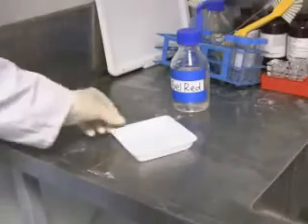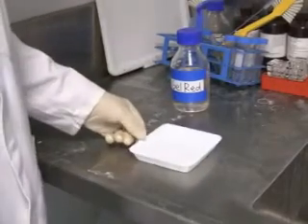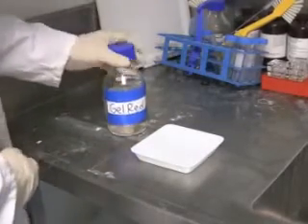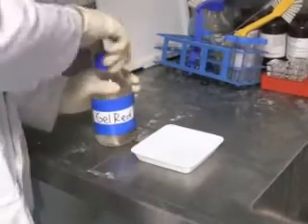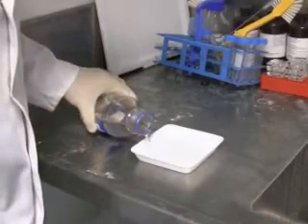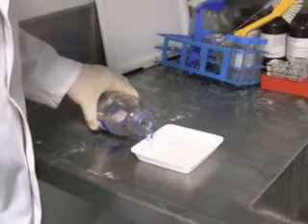At the staining station, make sure you know where your gel is — there will be a lot of groups staining their gels at once. Take the stain and carefully pour it in. You only need to just cover the gel.